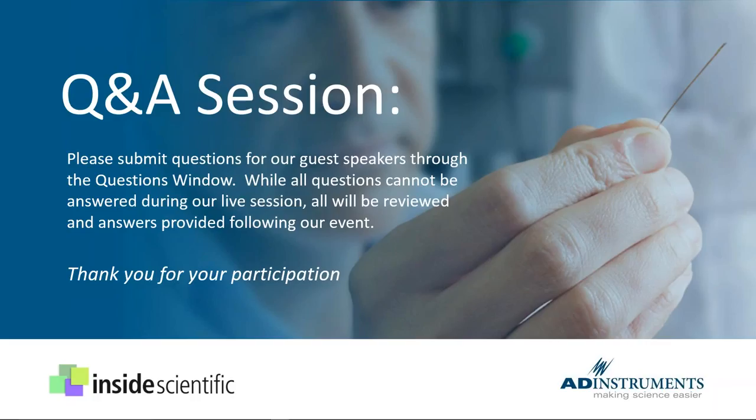Very good. All right. Another question, moving on to load independent measurements. Jim, in your experience, what are your best practices and tips for fitting the end systolic pressure volume relationship? On the last slide, you talked about how there can be extreme variability, and people should also consider whether they're going to be doing linear or curvilinear fits. So again, are there rules of thumb that you prescribe to ensure that the measurement is accurate in your eyes and also consistent from animal to animal?